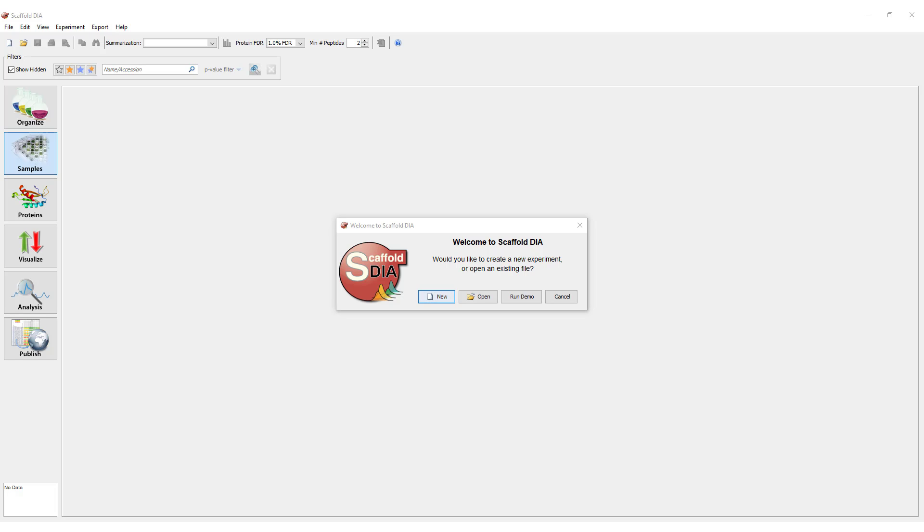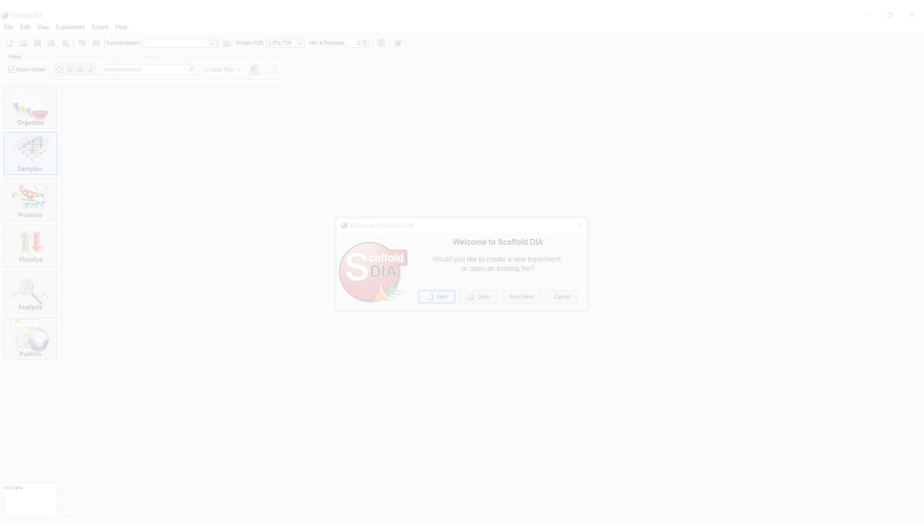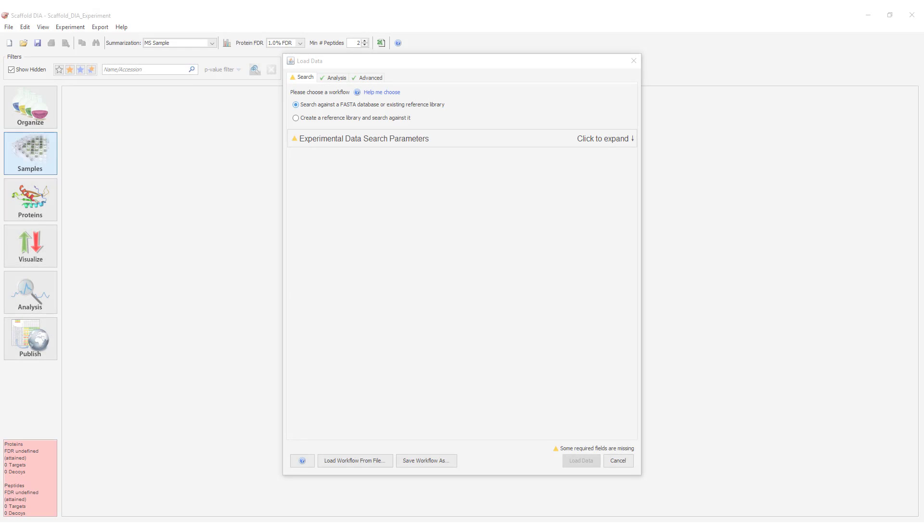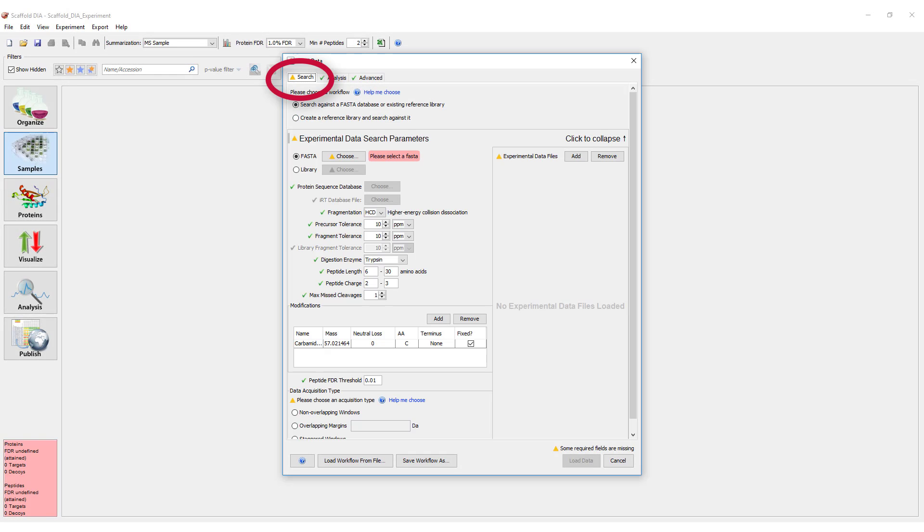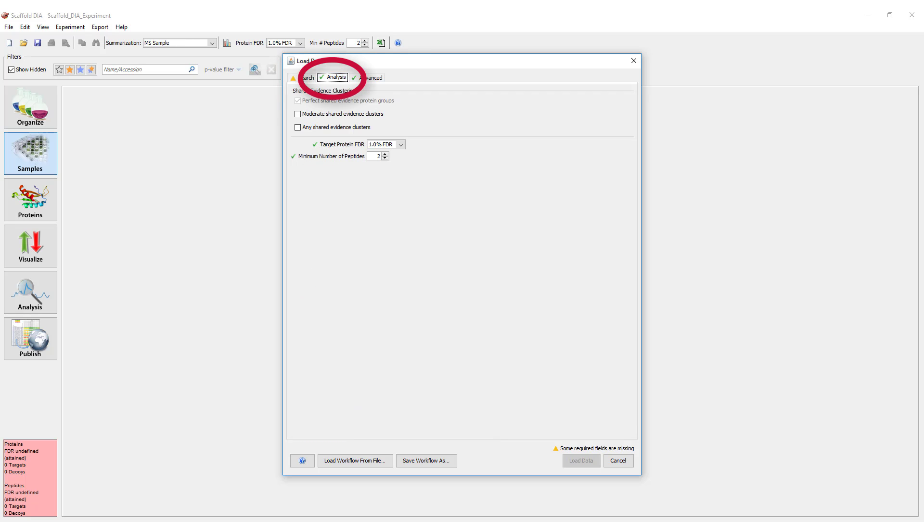Tutorial 1 contains information regarding installing and activating Scaffold DIA. Scaffold DIA uses a single-page workflow with three tabs to load data, as opposed to the wizard found in Scaffold. This streamlines the process.